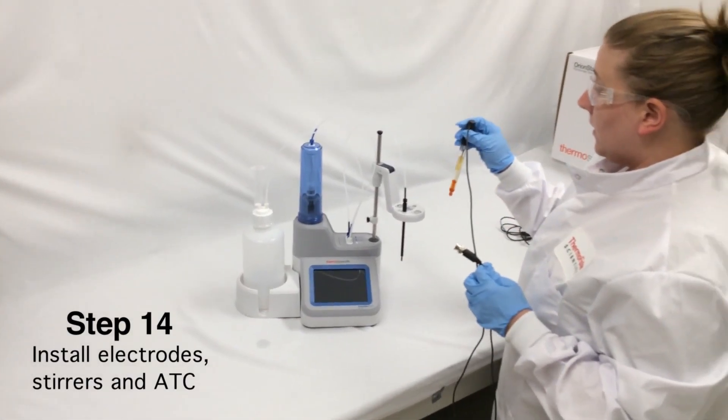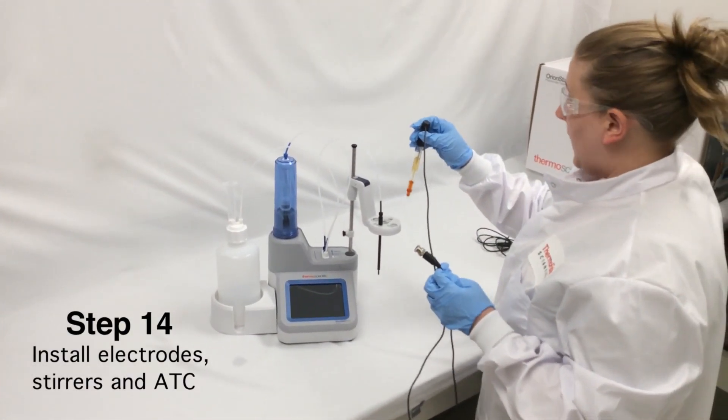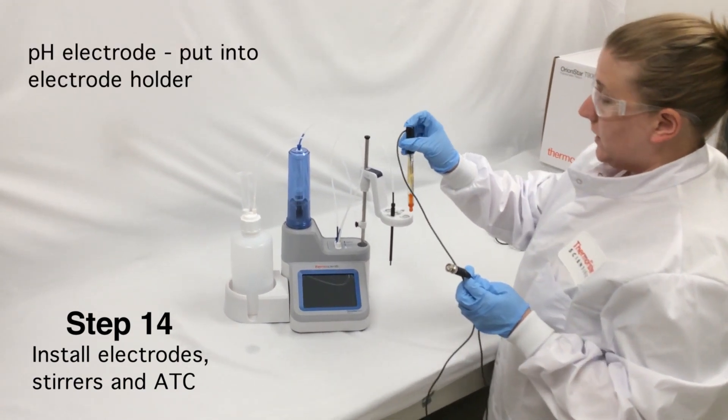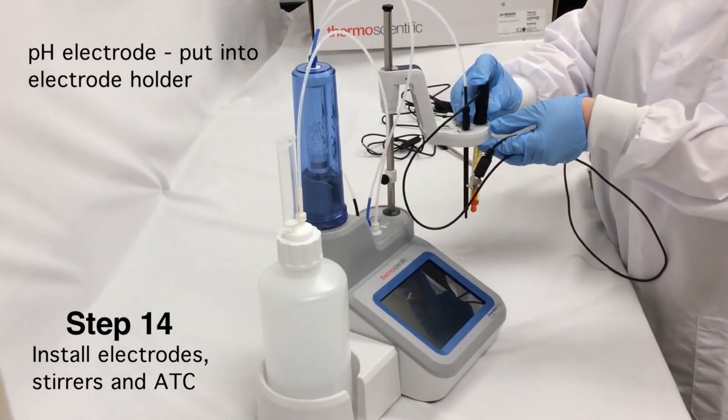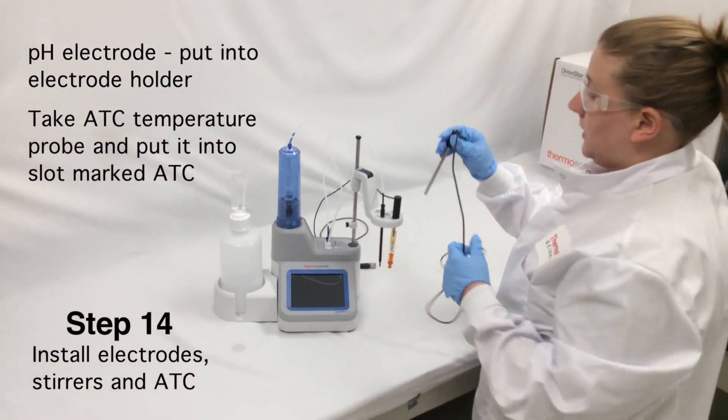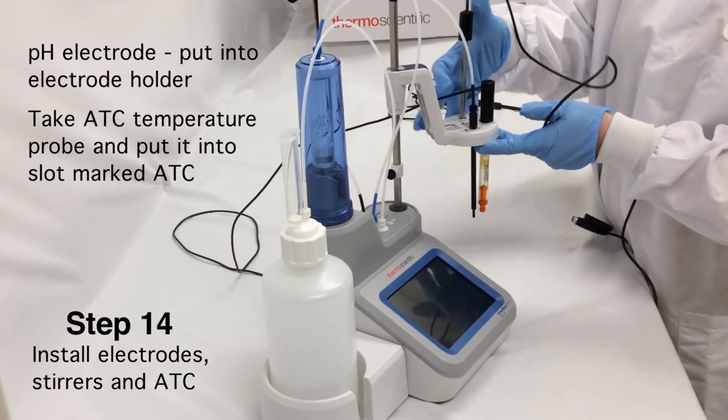Install the electrodes, stirrers, and ATC. Take the pH electrode and put it into the electrode holder. Put the ATC temperature probe in the slot marked ATC.